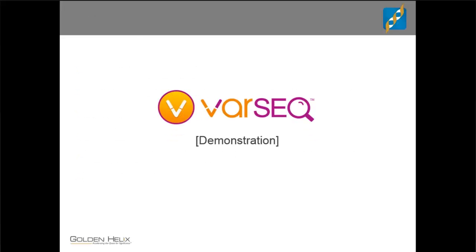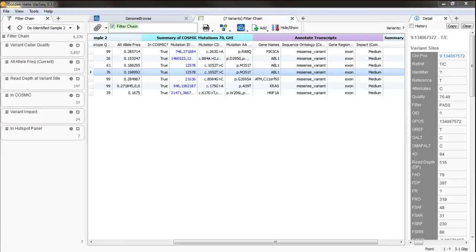Okay, so now let's start the second demonstration of VarSeq's capabilities here.